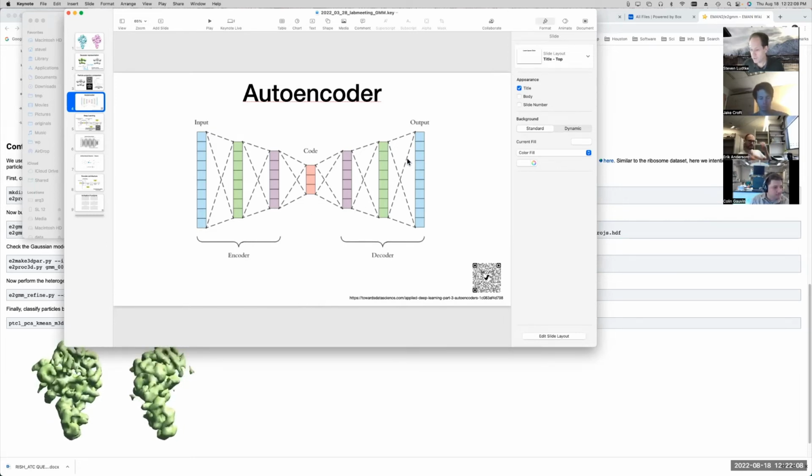No, because the network parameters here, which are kind of hidden, every pixel here is connected to every pixel here. So here to here, you have an n² relationship, right? So the number of parameters in the network is humongous. So yes, you could use this as a reduced representation for images, for sure. But if you're talking about saving disk space to recover the images themselves, you'd have to store the network, right? And the network is massively larger than the size of even a fairly large set of images.